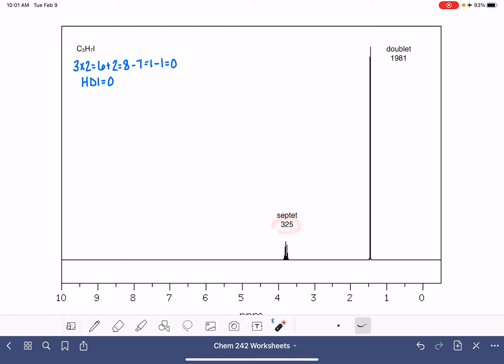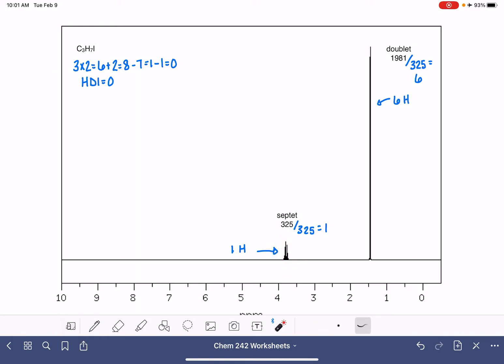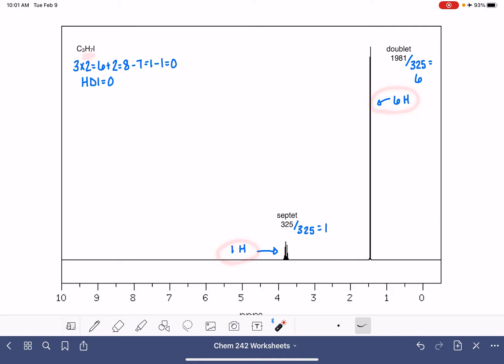Our integrals here are 325 and 1981. We want to divide both of these by 325 to get the ratio of the protons or hydrogen atoms in this molecule. 1981 divided by 325 is 6. So our integrals are telling us that there is one hydrogen atom generating this peak and six hydrogen atoms generating this peak, and the total is consistent with the number of hydrogen atoms in the formula. Our integrals look good.